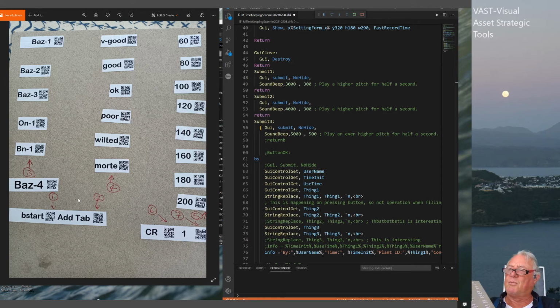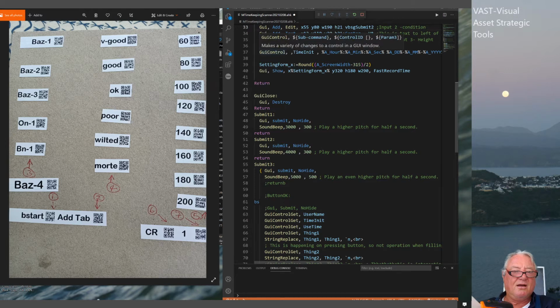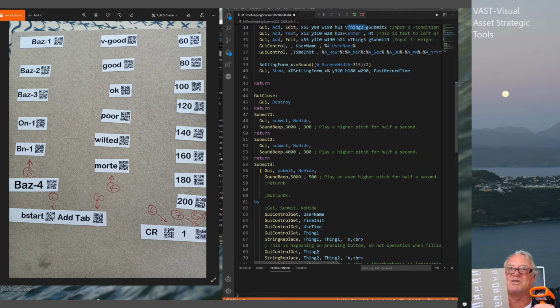So 2 things I want to talk about. One, to get this one, I've got a Dymo label maker that will create a QR code. These are 1/2 inch, so they're 12 millimeters high, and the actual QR code is only 10 millimeters high, and it reads reasonably well. Now with the distance in between, I have no problem. Blast, it's written something in there again, so control Z. See, it's actually writing data into there, so you've got to watch out with that.